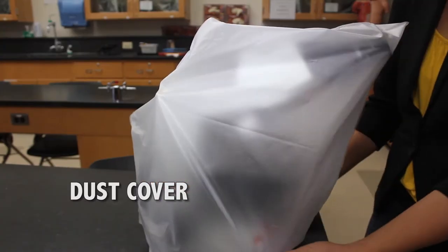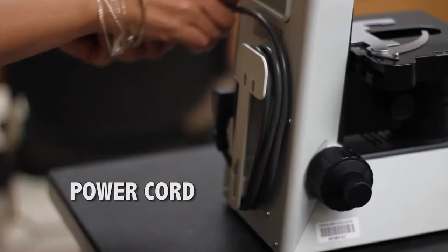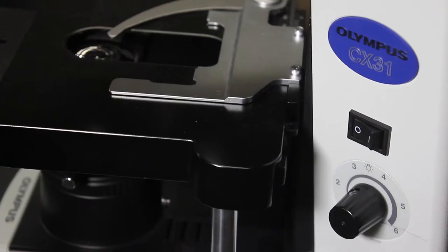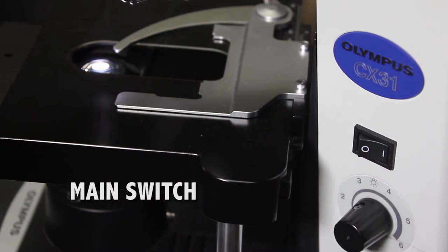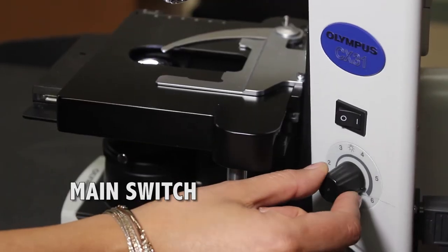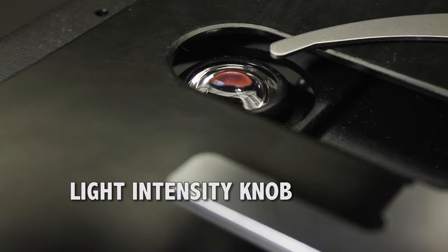Let's look at the different parts of a microscope. Dust cover, power cord, main on switch, light bulb, light intensity knob or dimmer.